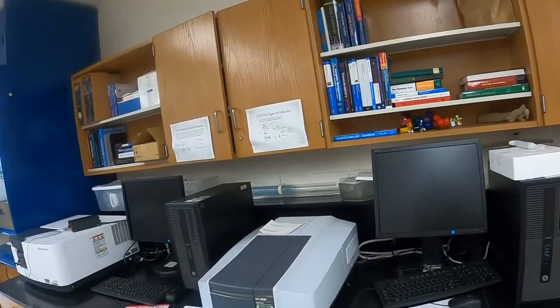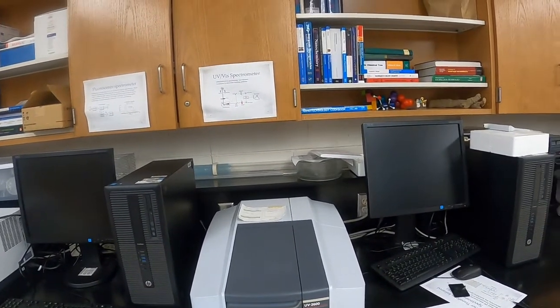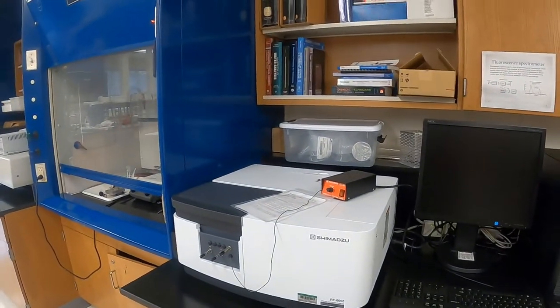A UV-Vis spectrometer can be used to very sensitively measure how much of a sample is present or how much of a chemical is present in a sample. You may have used a version of that in biology or chemistry called a visible spectrometer.